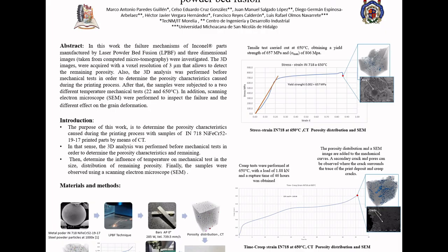Tensile tests carried out at 650 degrees Celsius gave a yield strength of 657 megapascals and maximum stress of 806 megapascals. Creep tests were performed at 650 degrees Celsius with a load of 1.88 kilonewtons, and a rupture time of 46 hours was obtained.